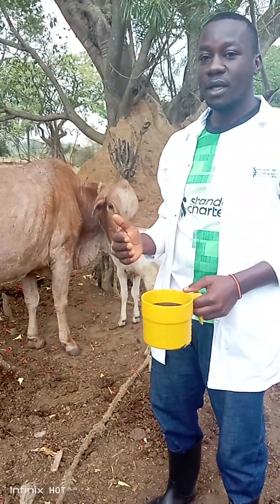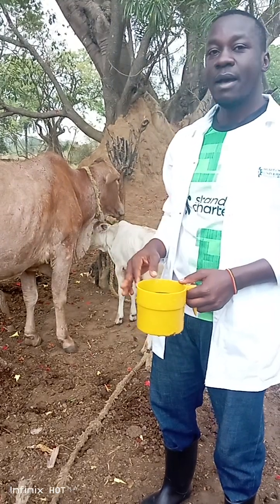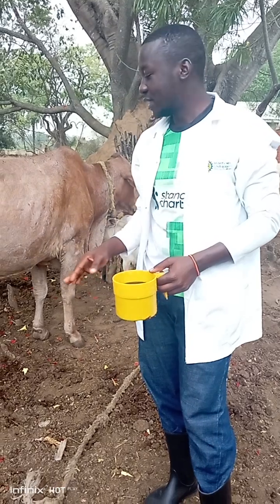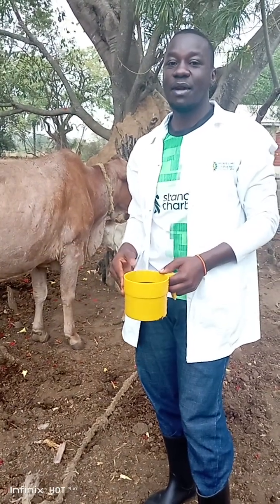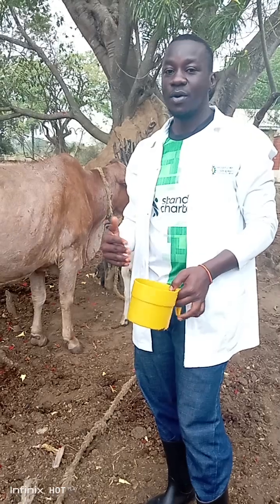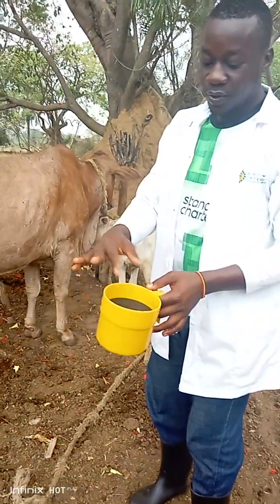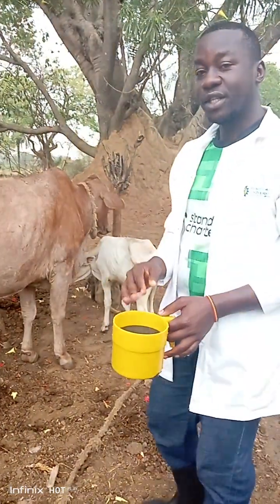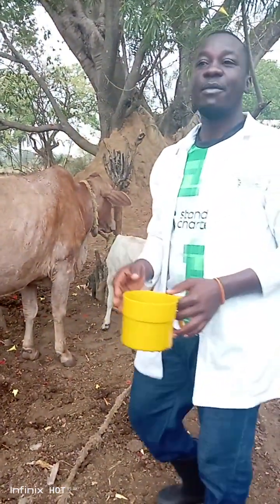I will be testing one teat at a time, because it does not necessarily mean that all the others are affected — it may be only one quarter or other quarters. So I am going to use this strip cup to take samples of milk from each teat to observe for abnormalities.